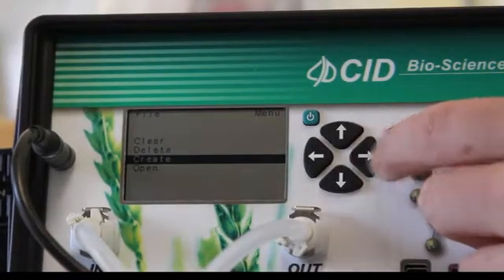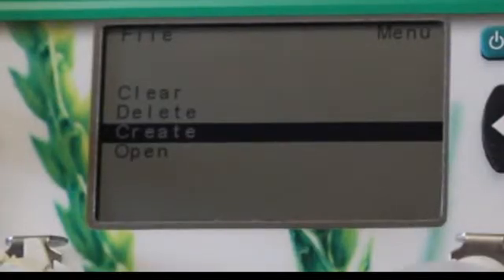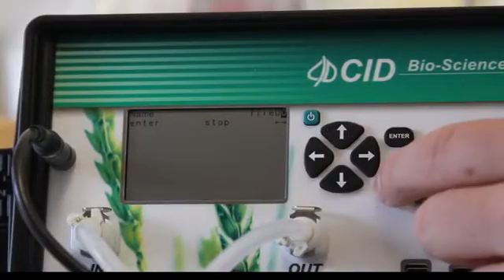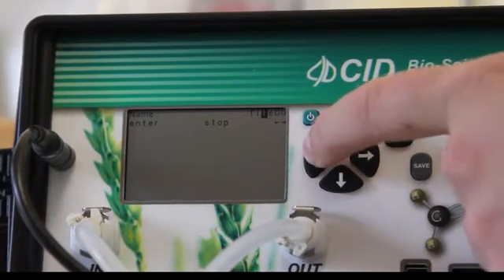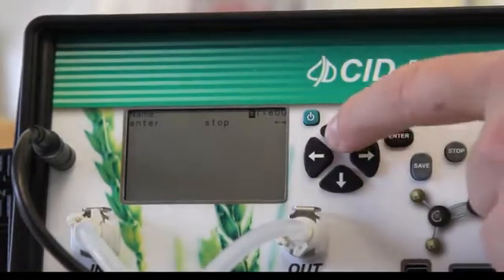Use the right arrow to open the File menu. Make sure the Create option is selected and press the right arrow once again to open the file creation menu. This is where we type in a file name for the CI900 to write measurements.